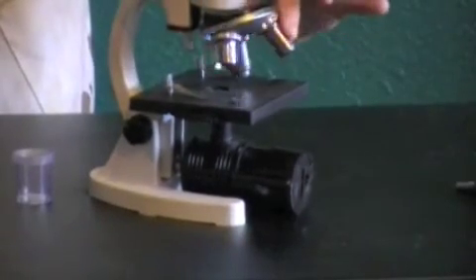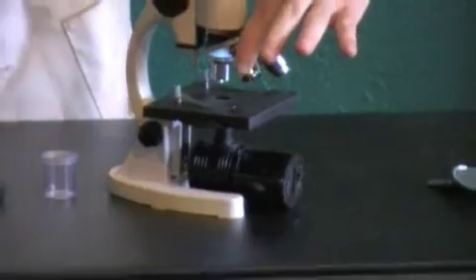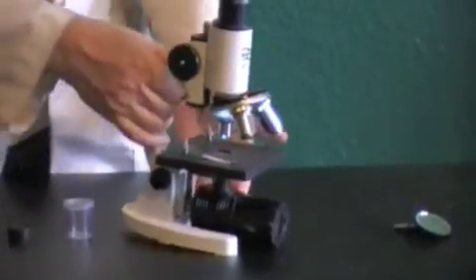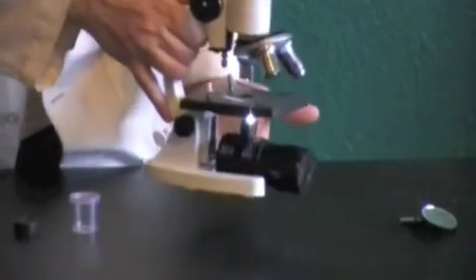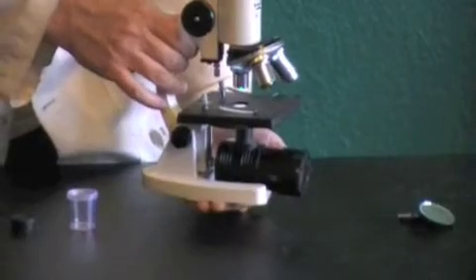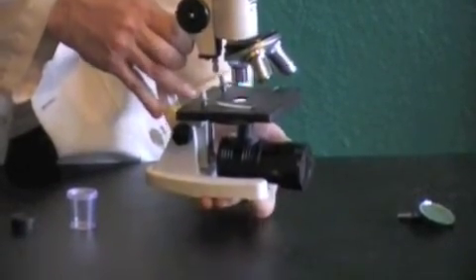So that's it. Make sure that when you are storing it, you store it with the scanning lens in place. Make sure that when you carry it, you use two hands to support it. The bottom hand supports the weight of it. The other hand just keeps you from dropping it.